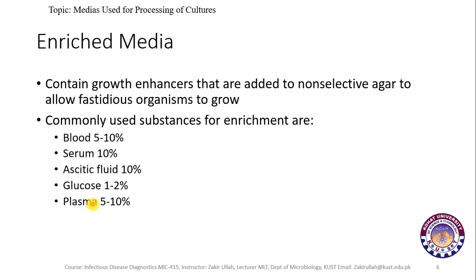Various concentrations of these components are required for preparing the enriched media and making it suitable for fastidious organisms to grow. An example of this enriched media is chocolate agar.